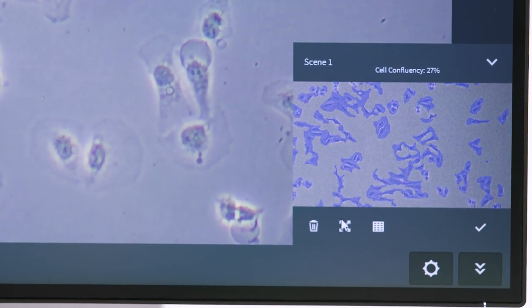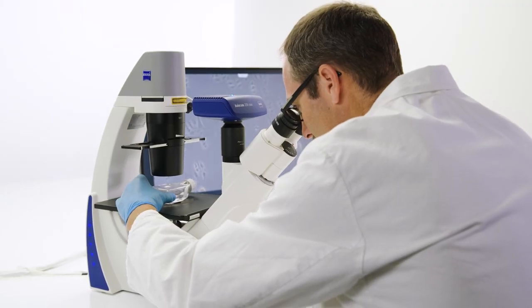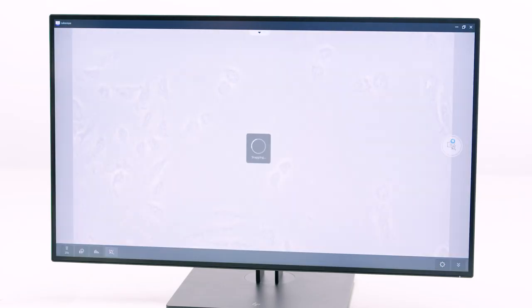You don't need to adjust any parameter. Then you simply move your cell culture sample from one area to another, taking images as you go.